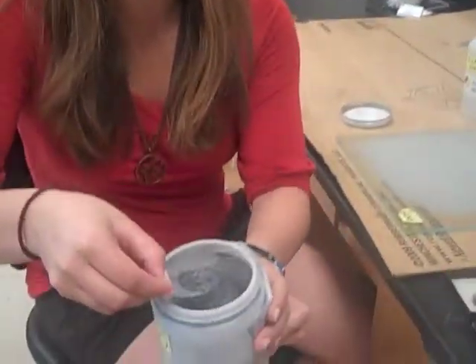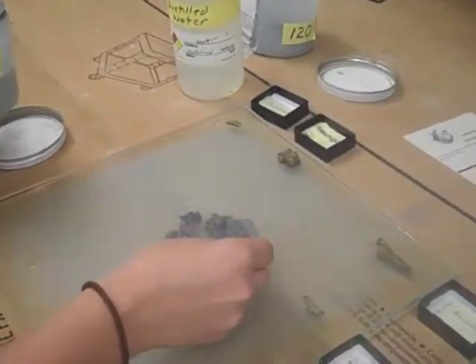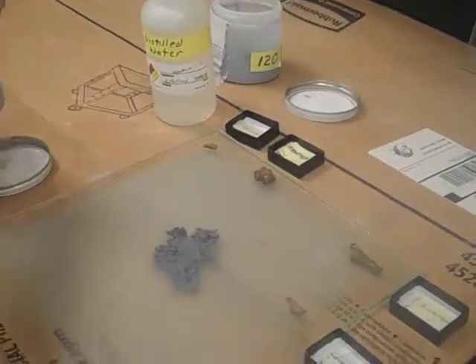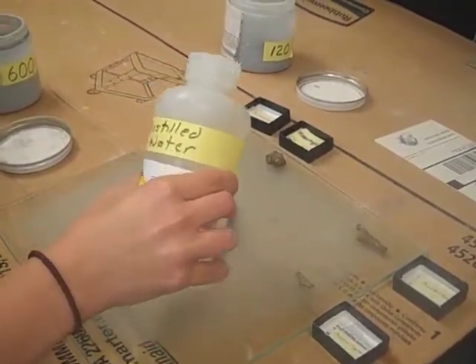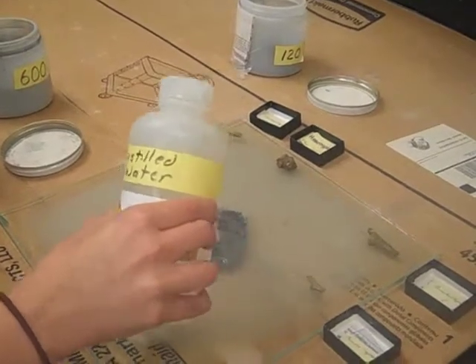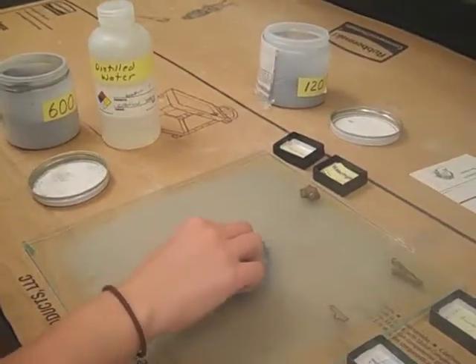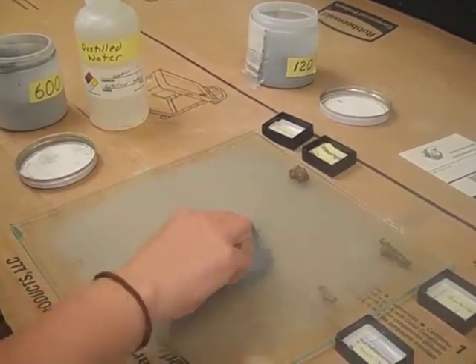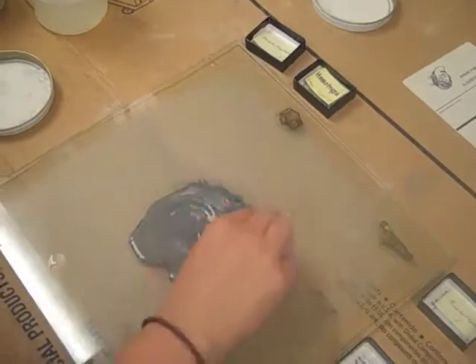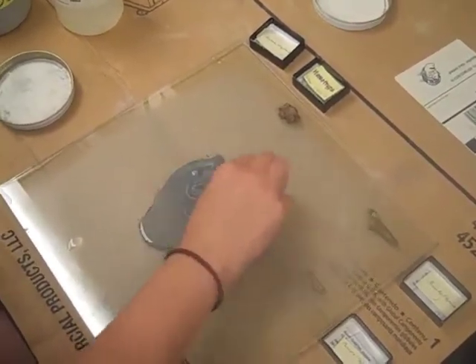Now we're going to move on to 600 grit — it's a little finer, as you can see. We're going to put some onto our polishing plate and add a little more water than last time because this is a finer grit. Then again, we're going to polish the same surface we were polishing before in nice figure-eight motions to get every angle of the surface.